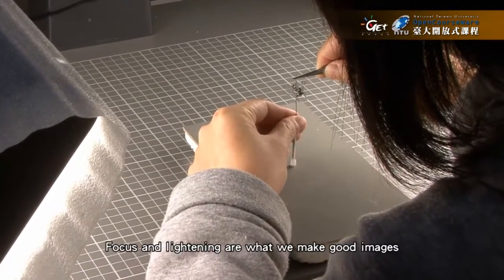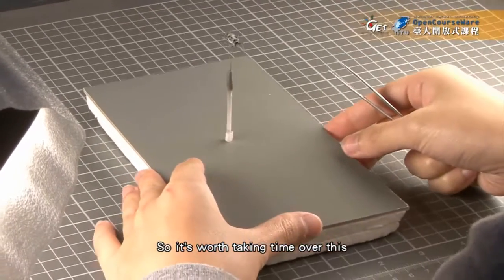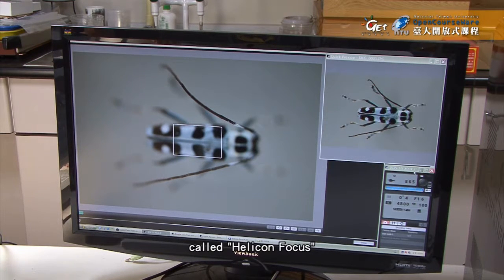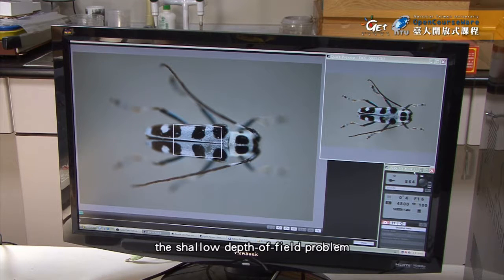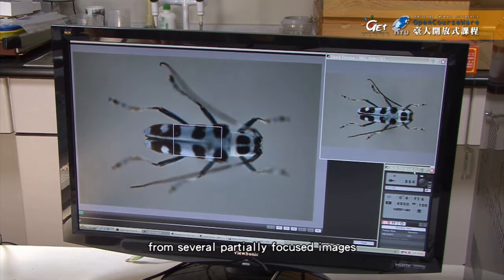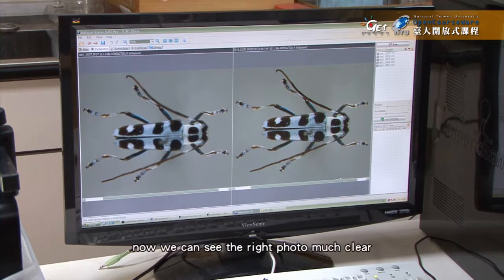Focus and lighting are what make a good image, so it's worth taking time over this. We're using overlaying photo software called Helicon Focus. This image-taking software completely solves the shallow depth of field problem. This program creates one completely focused image from several partially focused images by combining the focus areas. After the overlapping, now we can see the photos much more clearly.